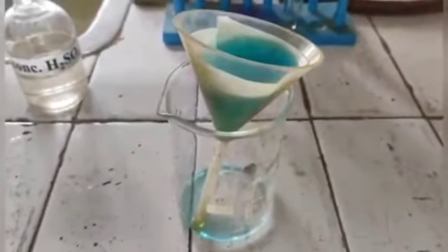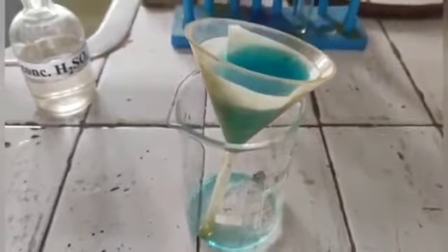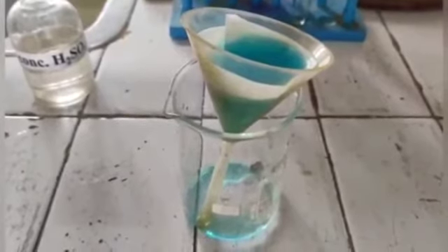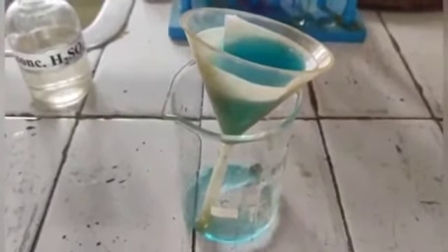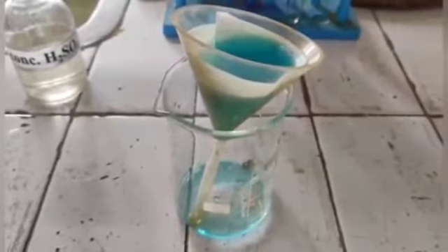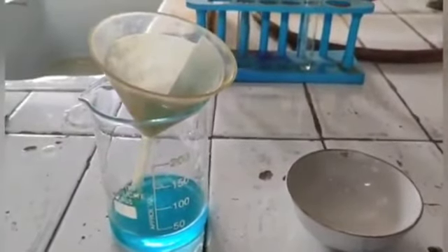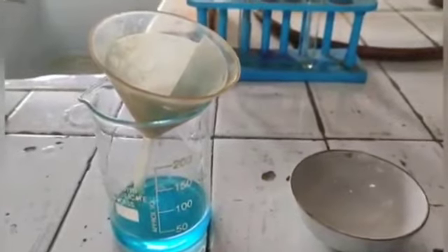Now, with the help of filter paper and a funnel, we will filter this saturated solution so that the insoluble impurities get separated from the solution. Now you can see we have got the filtrate after the process of filtration.